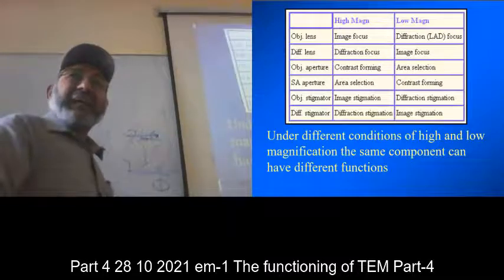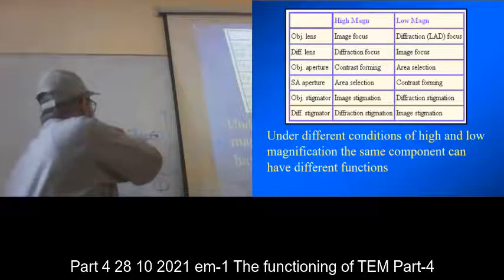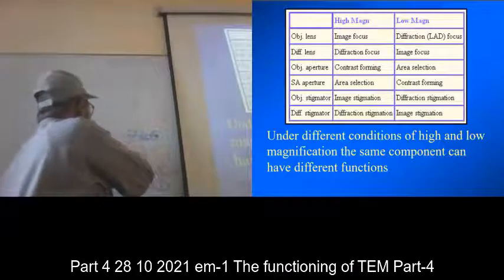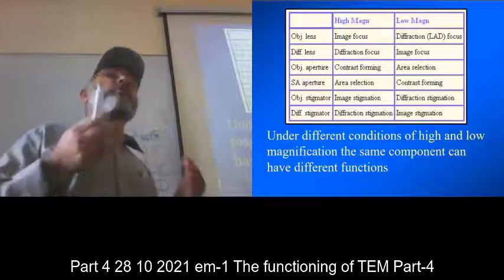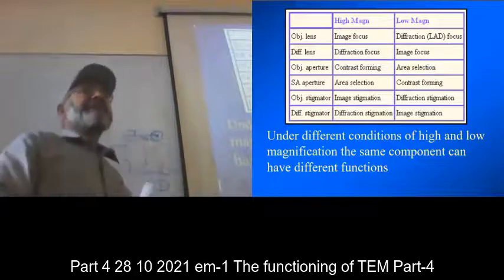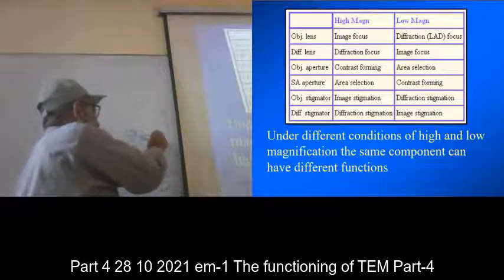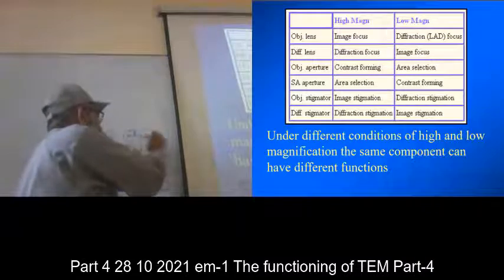It is not correct, and I will have to have spots like this, so that I can measure from the center of this part to the center of this part, and it looks also professional. If I have distorted spots like this, they are not professional. I need professional microscopy and professional diffraction. So I start from the center of this to the center of this and measure this.